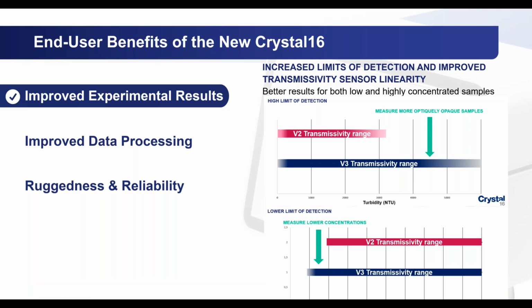And here you have a comparison where we compared the V2 with version 3, the current version now, and where we tried, by using nephelometric units, standards actually, to see how much we see at this moment versus what it used to be.